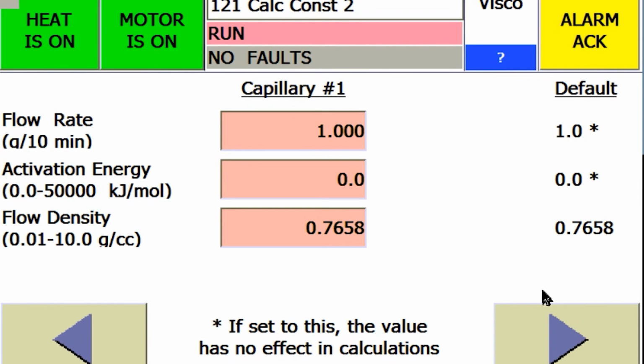Flow rate is related to pressure correction between process pressure and rheometer pressure. For most materials, those corrections do not need to be made. Please contact Dynisco for assistance to determine if flow rate entry is needed. Activation energy is used if the process and rheometer are run at one temperature, but the material is tested in your lab at another temperature.